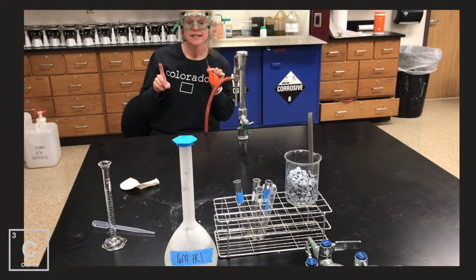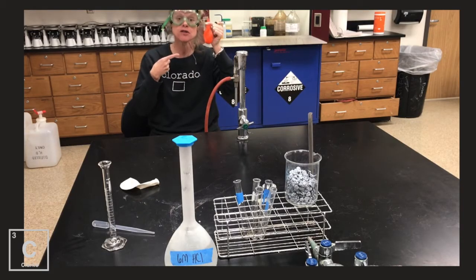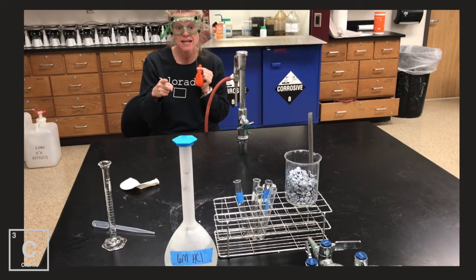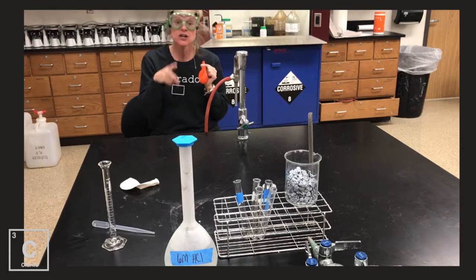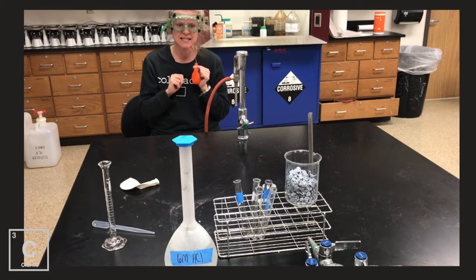We are going to need to figure out what kind of gas this reaction produces. So we need a comparison sound. I'm going to blow this balloon up with my own carbon dioxide, and we are going to listen to the sound that it makes when I set it on fire and ignite it. Then later in the reaction, I'm going to do the same thing for the gas that I capture so we can compare the sound and see if we can figure out what kind of gas it is.